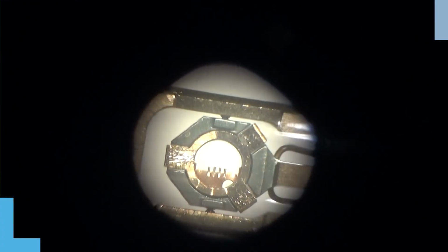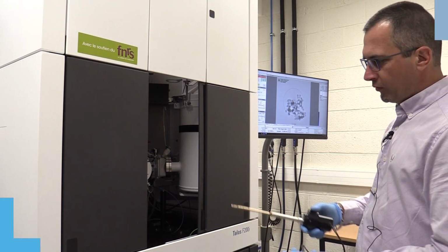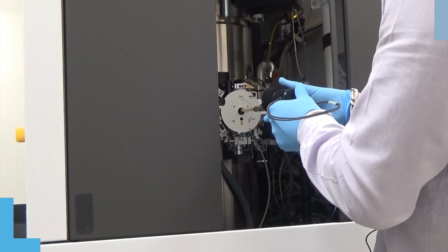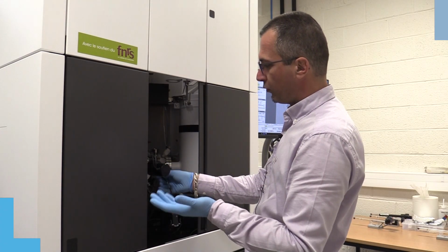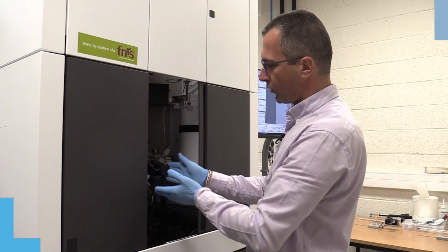Once the sample is installed in the sample holder, we have to insert it into the microscope. So we put it in the stage, which can then be used to move the sample inside the microscope. And as there is a very strong difference between air pressure here and the secondary vacuum in the microscope, we have to pump the holder for a couple of minutes.